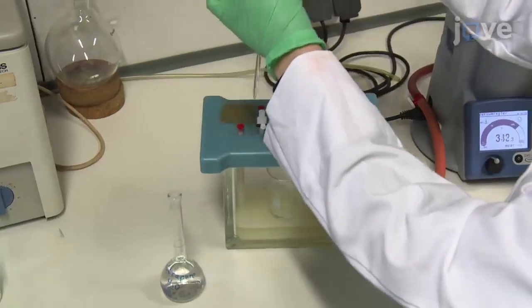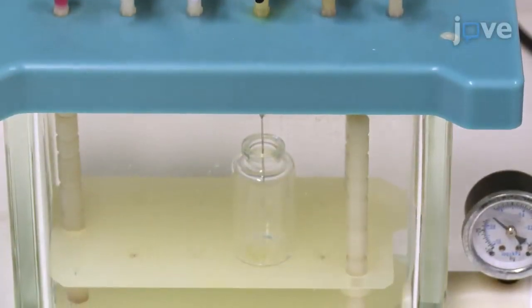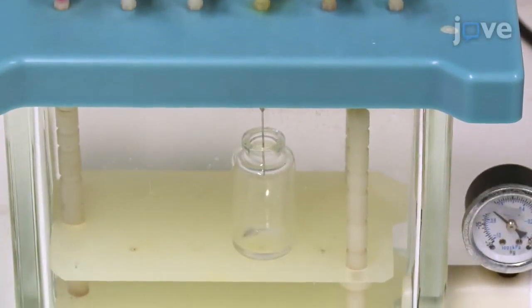Make sure to use a solid phase extraction cartridge with the right solid phase. Wash the sample with three milliliters of ultra-pure water. Then use three milliliters of ethanol to elute the analytes from the cartridge sorbate.